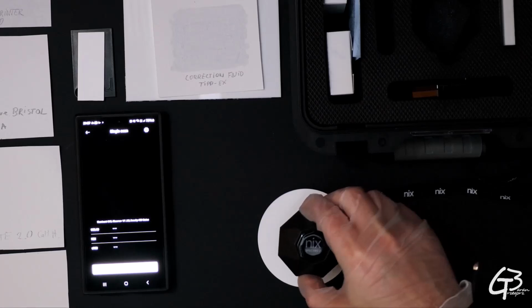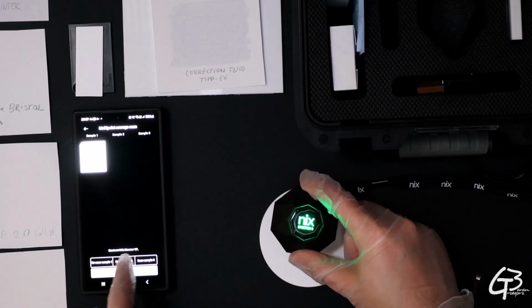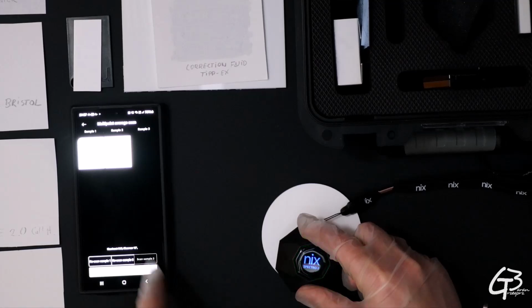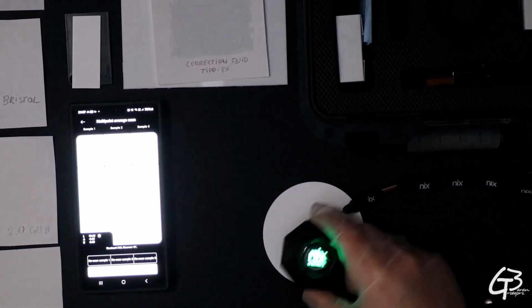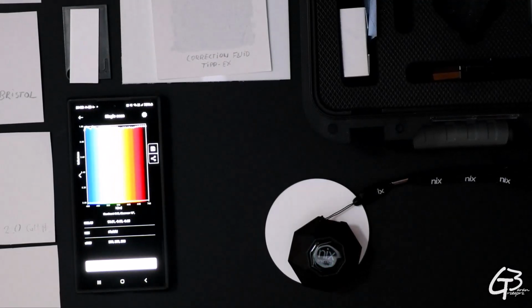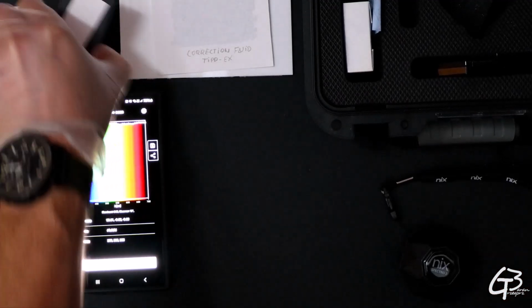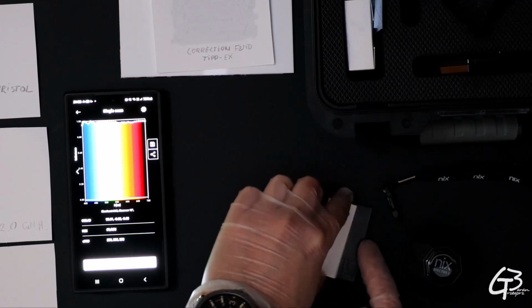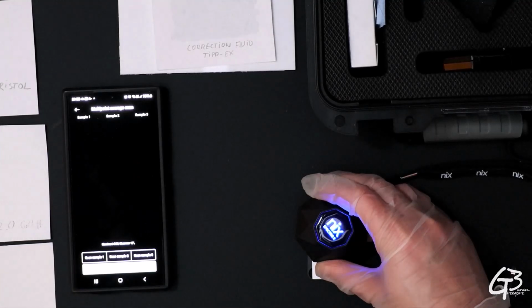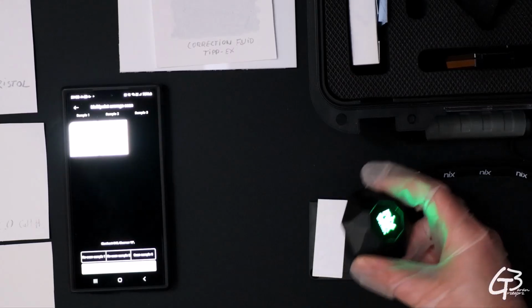Since we deal with substances which might include optical brightening agent, and therefore look different under different lighting conditions, I measured each sample twice, with and without the ultraviolet component. To keep this comparison clear, I won't present both M1 and M2 results if they were close enough and the difference wasn't relevant. I will mark this only if the OBA component made the difference, and since we search for the whitest white, I'm going to consider the brightest readings as the final ones. Last but not least, to avoid any light pollution, I measured all samples in a dark environment. And here are the final results.